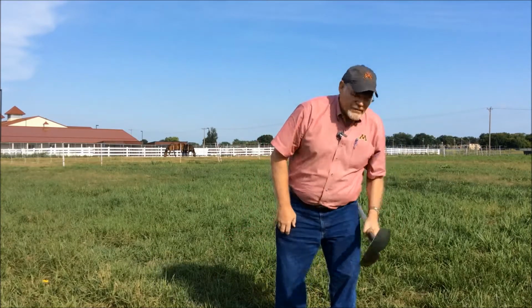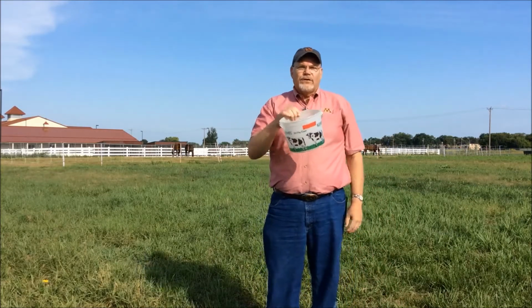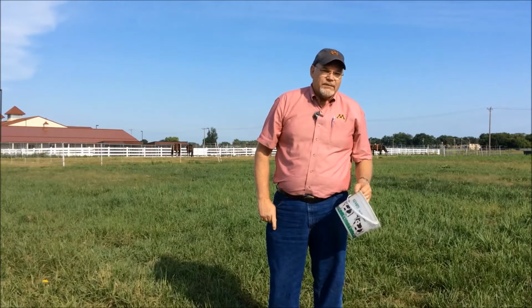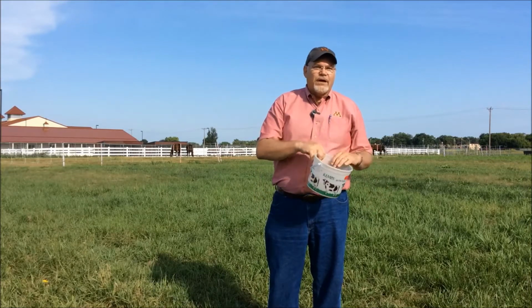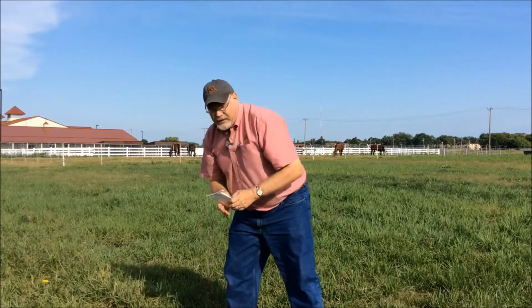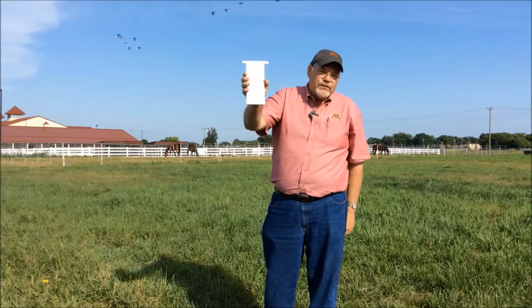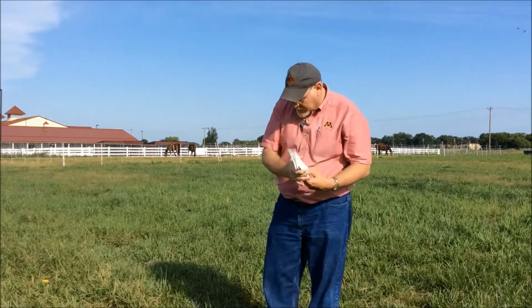What other things do you need then? Helps to have a bucket to put the cores into. The bucket should not be a galvanized bucket, metal bucket, because galvanization has zinc in it and it can foul up your analysis. Then you also need to get bags to put the sample in after you've taken it. These bags are from the University of Minnesota Soil Testing Laboratory, and we'll use those in a little bit here.